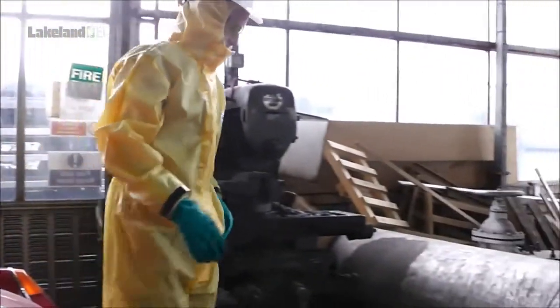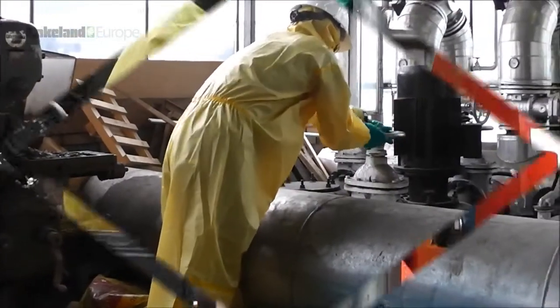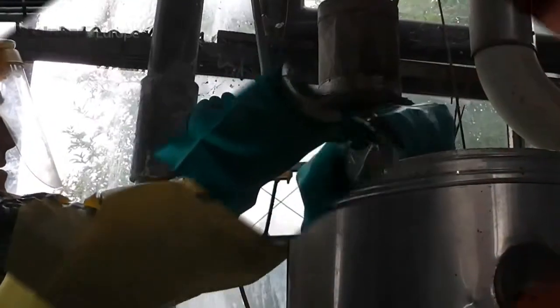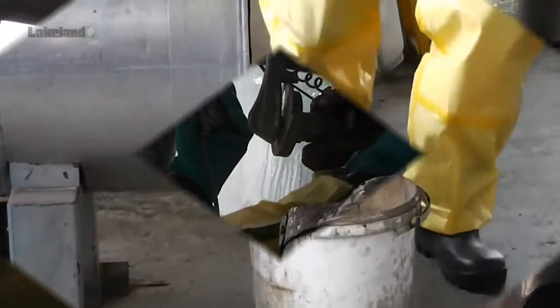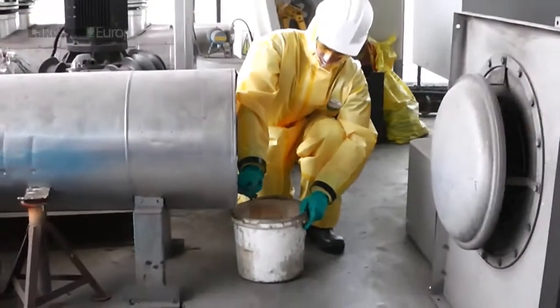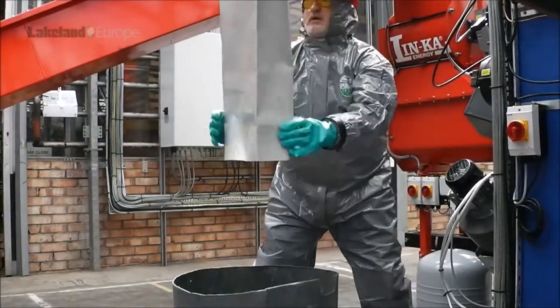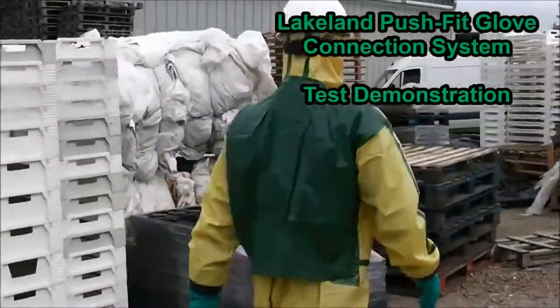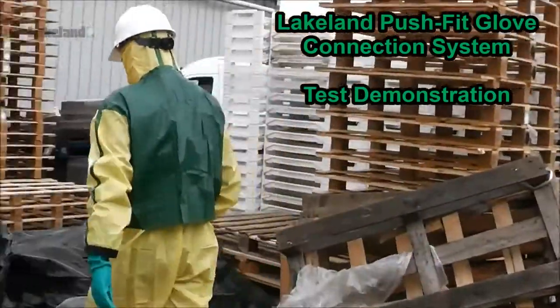Lakeland's Pushfit glove system is an innovative method of attaching a variety of chemical gloves to our Chemmax chemical suits. It provides an effective liquid-tight seal between sleeve and glove and has been tested to a Type 3 jet test. Our glove fit system donning video shows how simple and quick it is to attach and replace gloves, but we also wanted to show you how effective it is, so our Lakeland technicians developed a simple test to demonstrate.